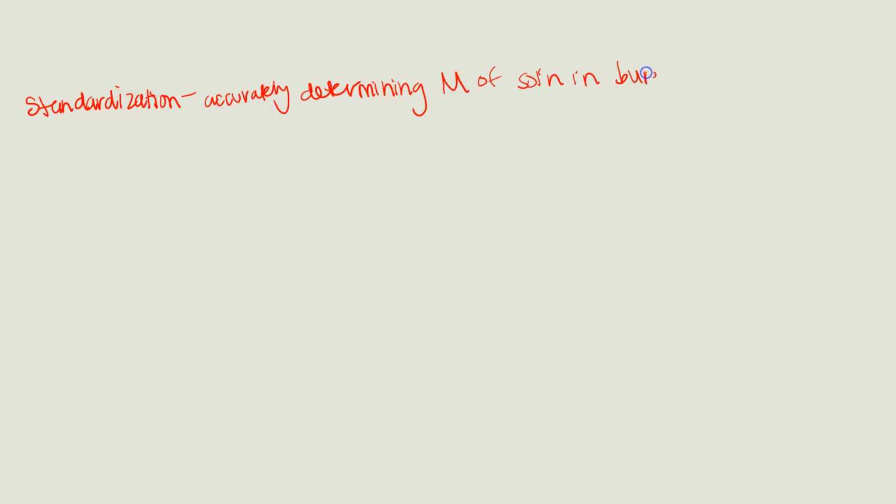When I used to work in industry where I was testing pharmaceutical drugs, I'd start my day actually calibrating all of the balances, making sure they were level, putting little masses that we accurately know their mass on there, making sure that it works out, calibrating the pH meters, which you will learn how to do here in a little bit. And then I would make solutions as I needed for the day, and then standardize the solutions that I needed to know accurately.